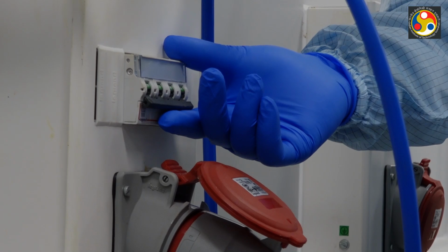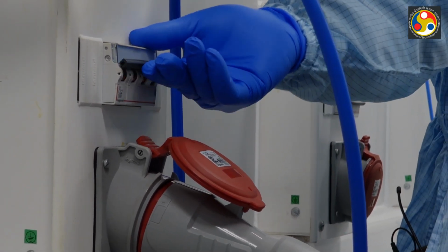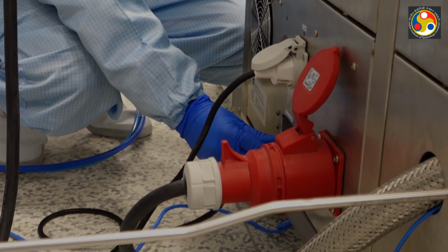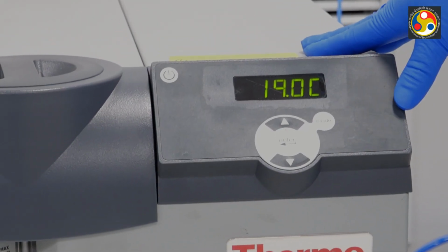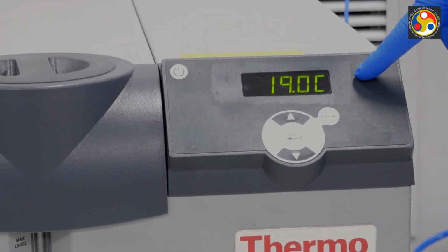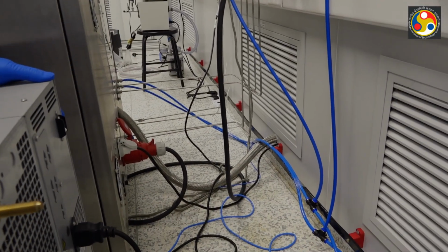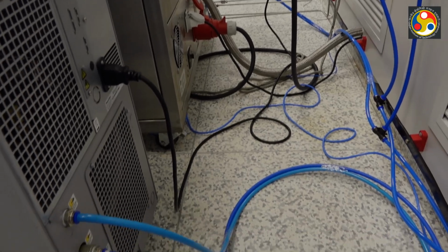So this is the main power supply of the PECVD equipment. I am going to turn it on. This is the chiller of the machine, which is already turned on, and it is maintained at 19 degrees Celsius. You can see these blue lines containing chilled water supply, which is required for this machine.